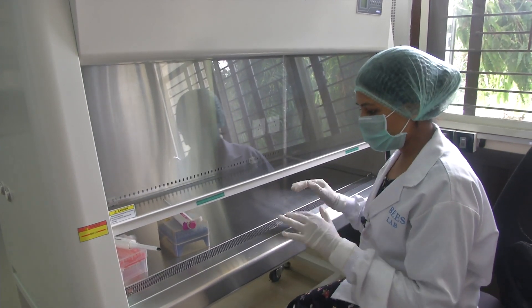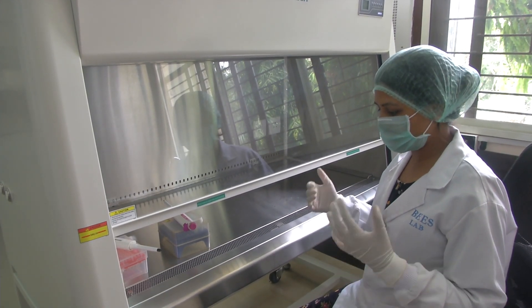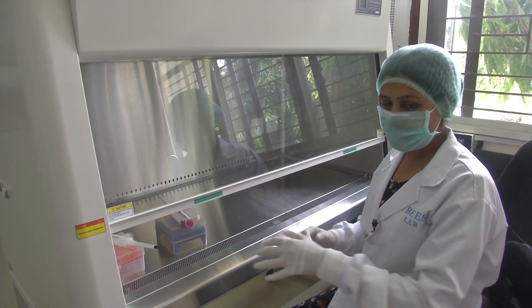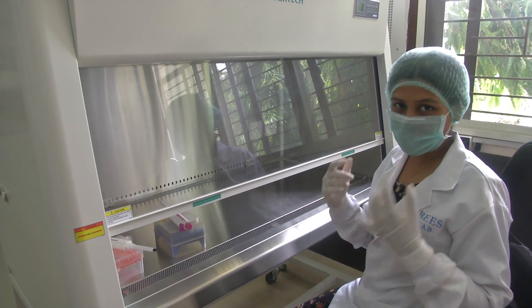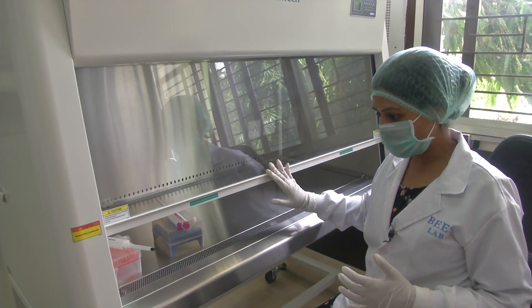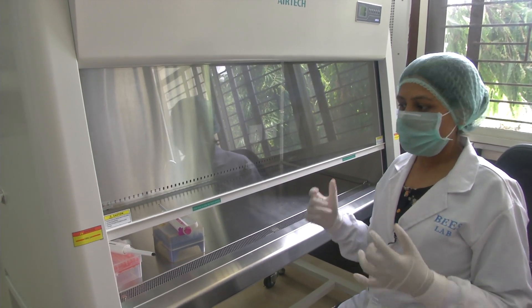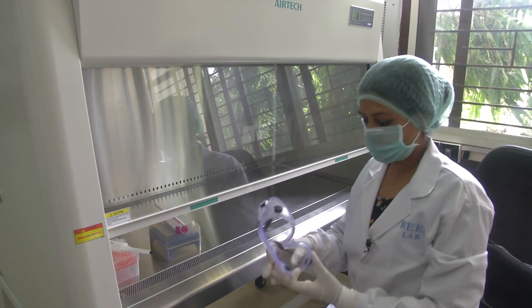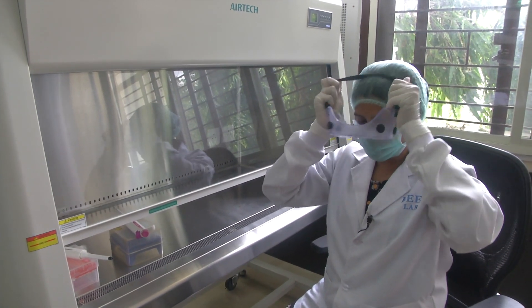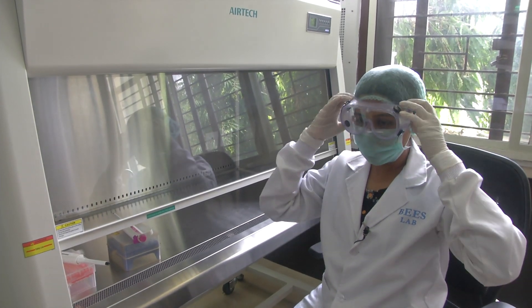Now, even before I work, I follow personal protective equipment guidelines. The PPE includes hand gloves, a face mask, and a hairnet. Additionally, even before I use the BSL hood, I need to ensure I have my eye gear on — these are the eye gears I am supposed to use before I start working using the biosafety cabinet.